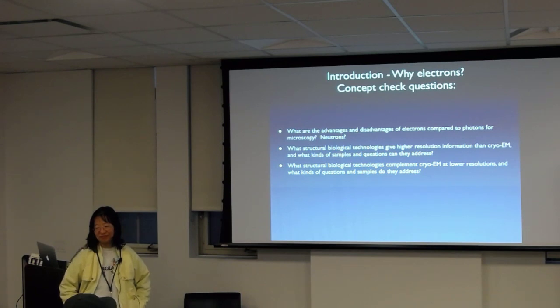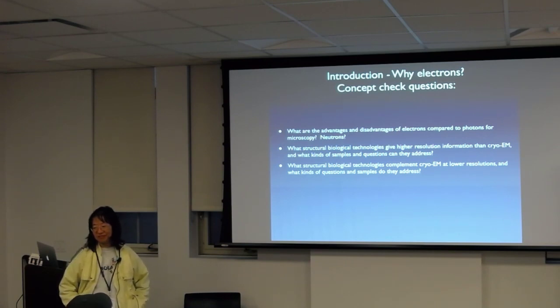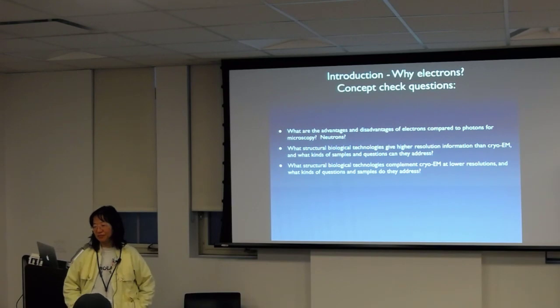Like the monochromator for neutrons, I believe, is just sort of like a spinning filter, pretty much. So it basically just blocks out neutrons at different speeds, physically, as opposed to doing it in another sense. Neutrons can do a lot of interesting experiments, like probing the actual composition of the atoms based on the scattering properties. I can't remember. That was a good answer.